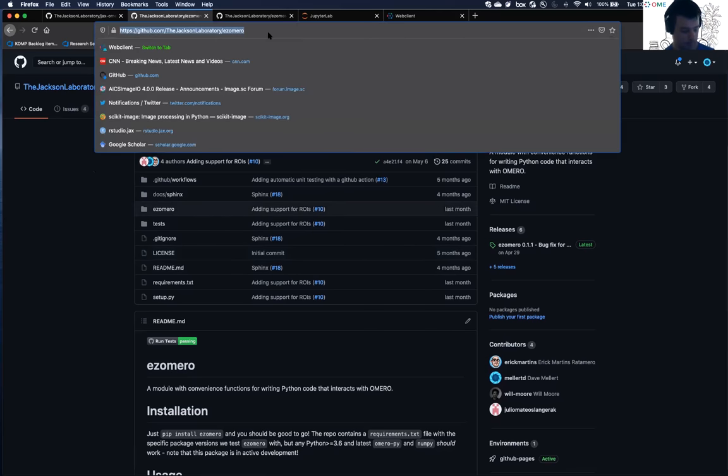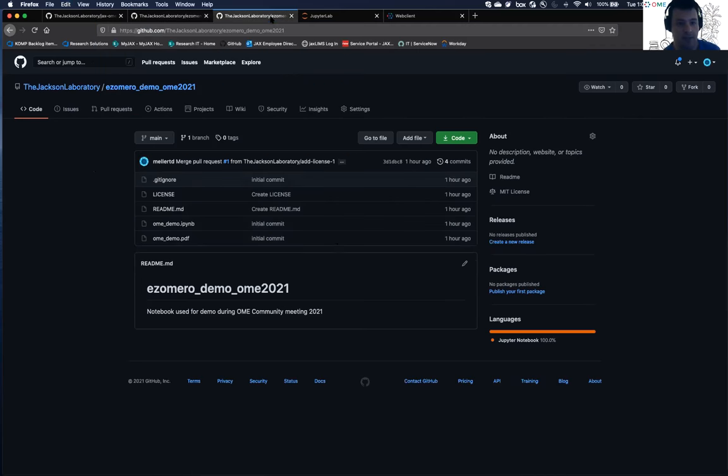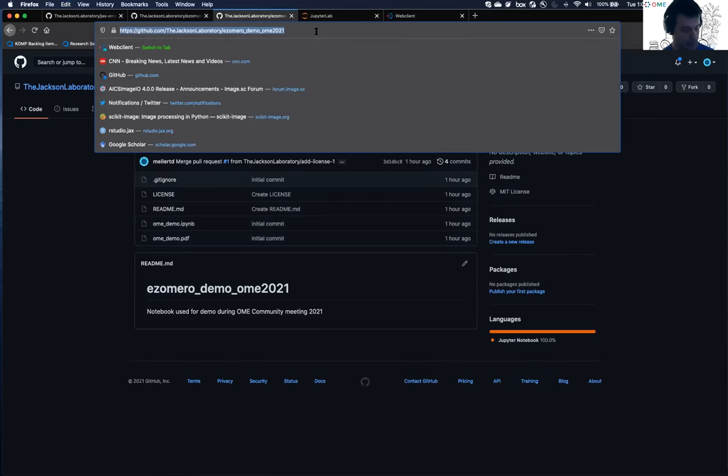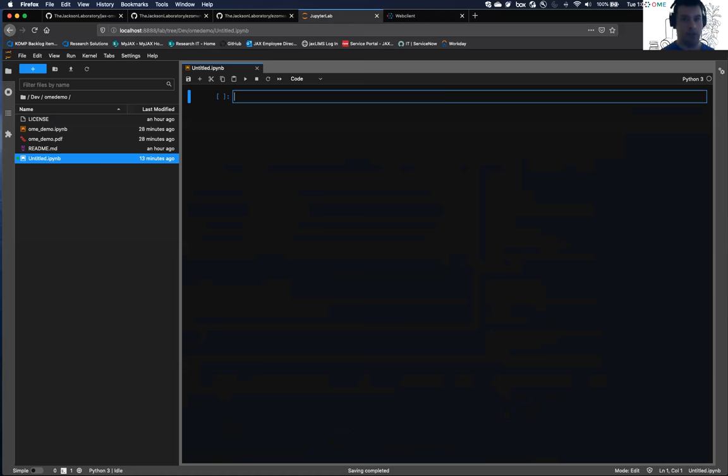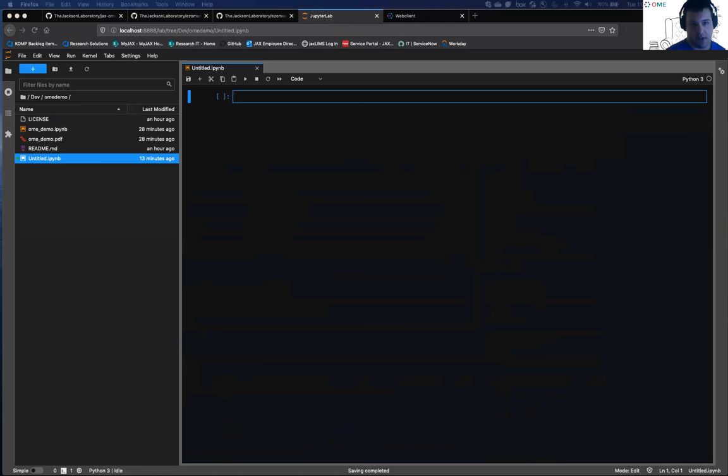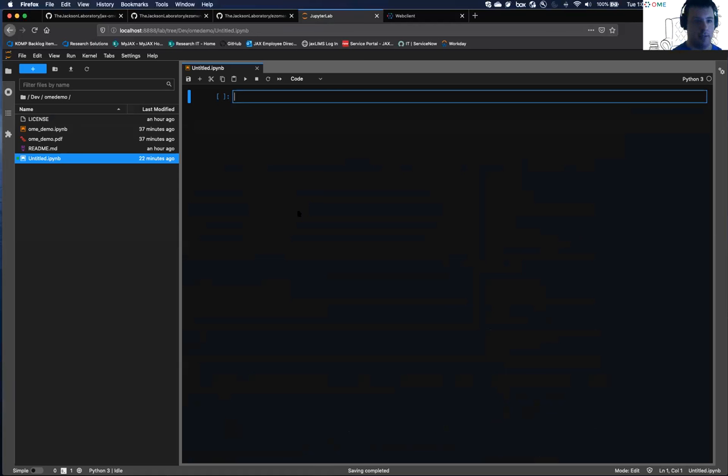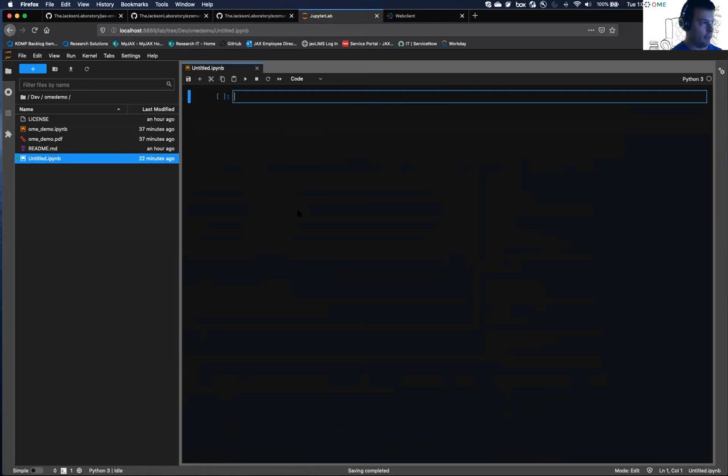So named because we felt like it made our Python Omero experience a little bit easier. And I will focus on this in the demo today, but I want to start out with the caveat of everything I'm showing you today is meant to supplement what you get with the Blitz Gateway API.